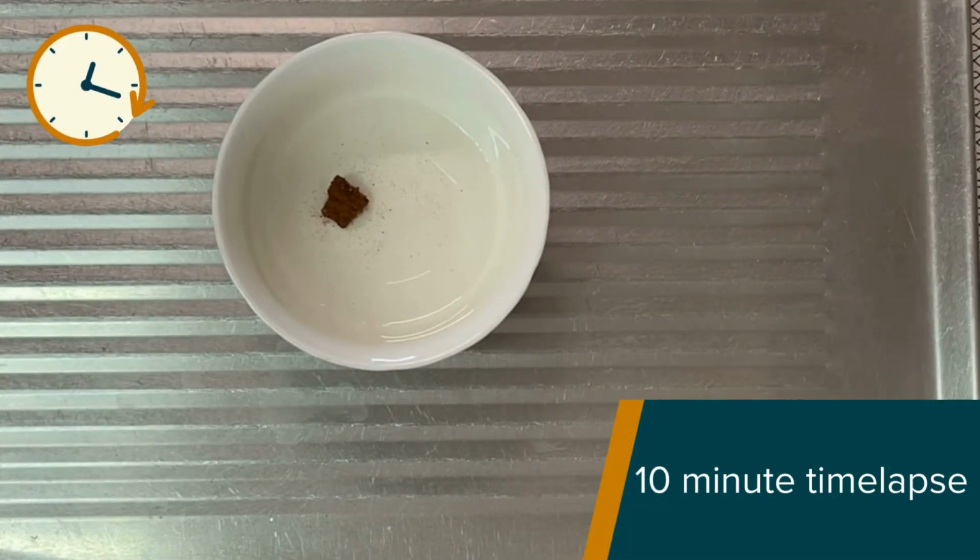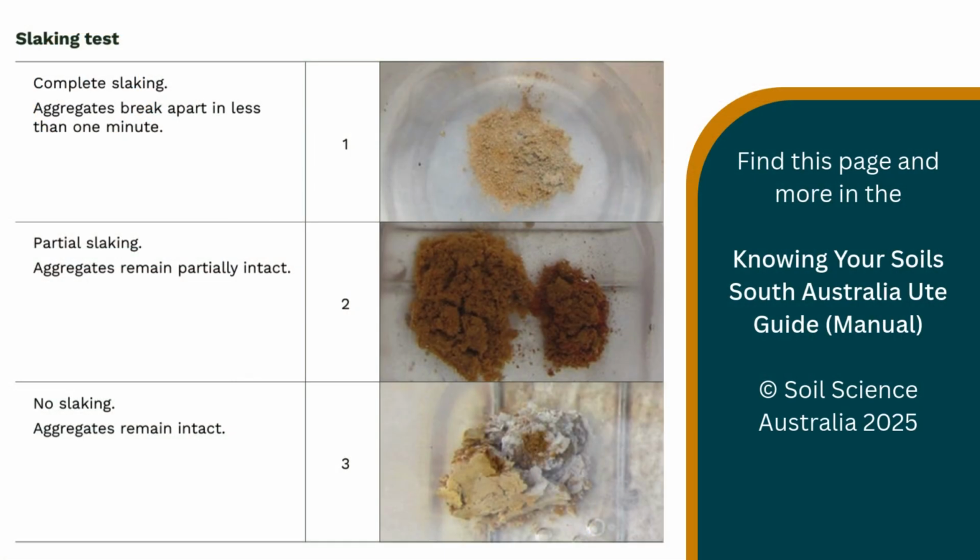So we want to check at 1 minute. In this case, nothing's happened, which is great. We then want to go for another 10 minutes. And at the end of this time lapse, here is 10 minutes, and you can see there's really no change, which is really good.